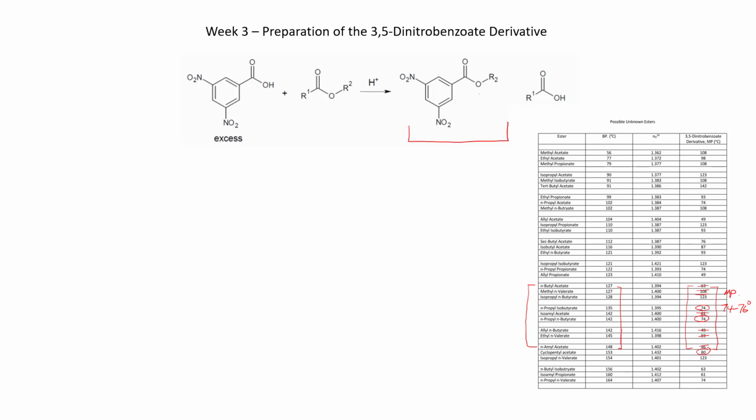So basically these derivatives are taking this alcohol group and adding it onto the 3,5-dinitrobenzoic acid.